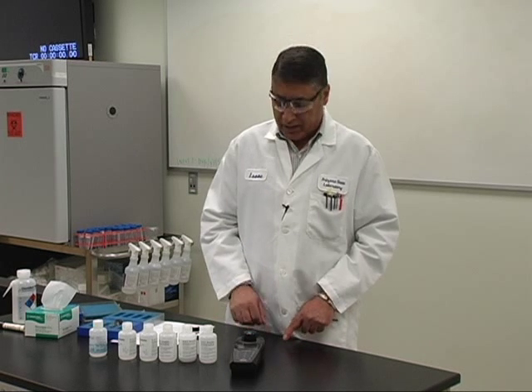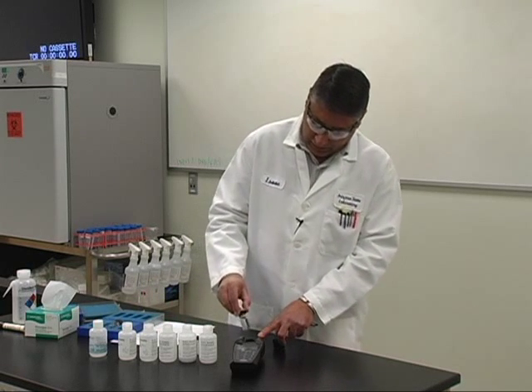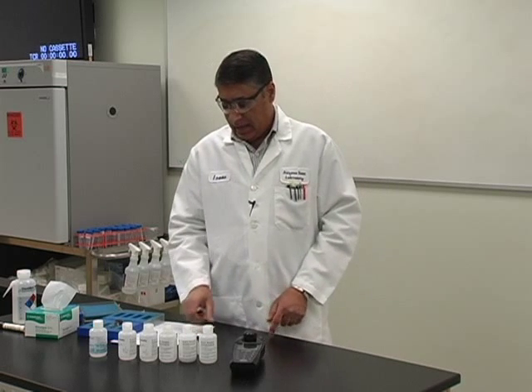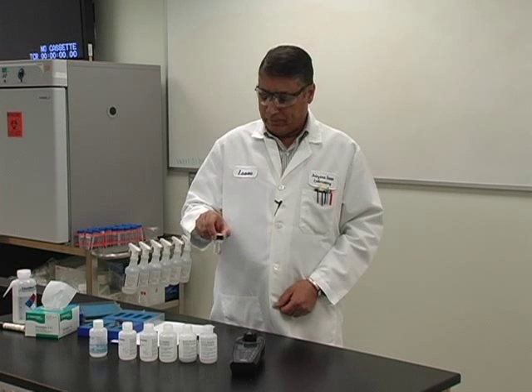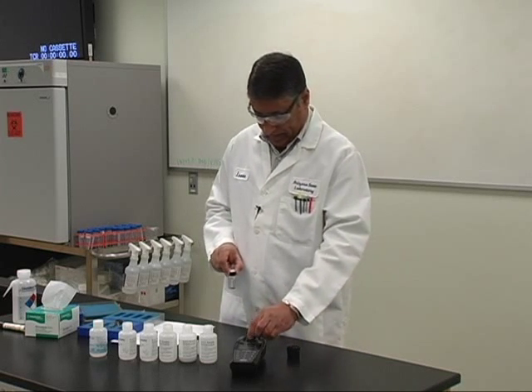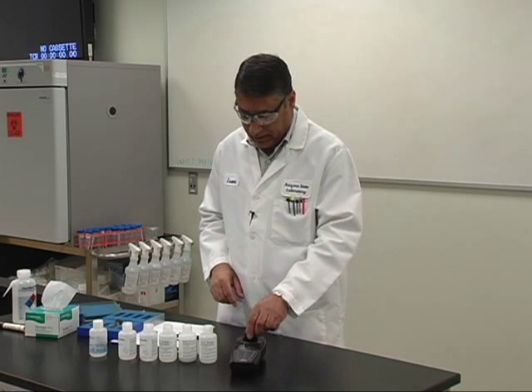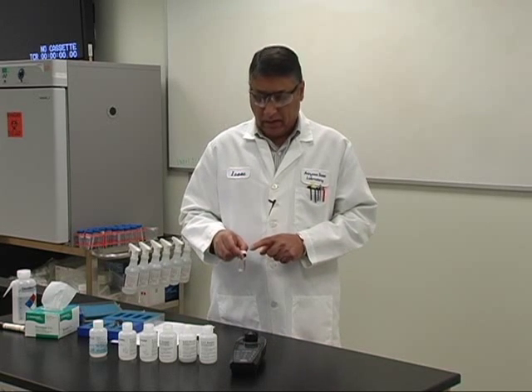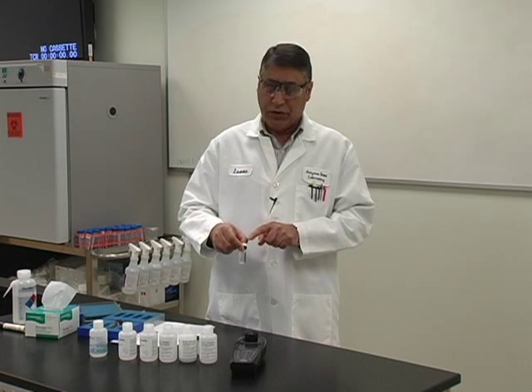The meter is done reading the blank and is now asking me to put in the 1 NTU standard. Take the cap off and put the 1 NTU standard into the meter and hit YES. It is going to take the same amount of time, about 30 seconds. The meter is done reading the 1 NTU — take it out and insert the 10 NTU standard, then hit YES. I have the lot numbers and expiration dates labeled on the vials so there is no confusion about which standard I am using.